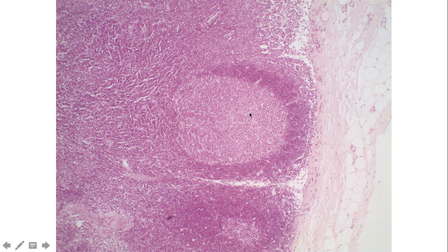And so again, here's another look of outside capsule, dense irregular. And then as we move in, we get into the cortex, and the cortex is where you're going to find these follicles. Here, the lighter area of a follicle is referred to as the germinal center. And this whole structure is primarily composed of B lymphocytes that are able to identify particular non-self antigens and respond to those.